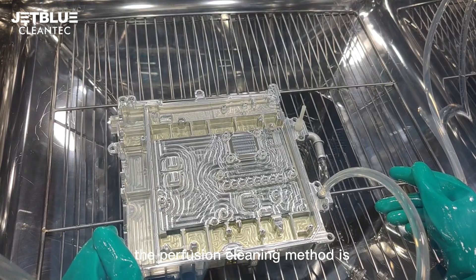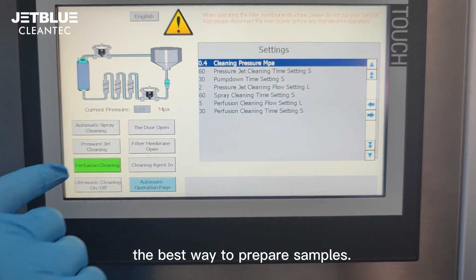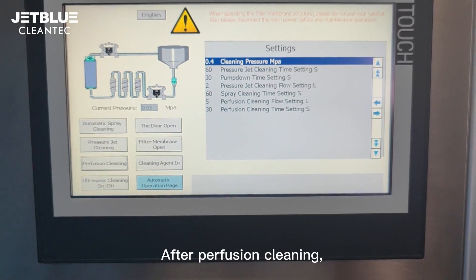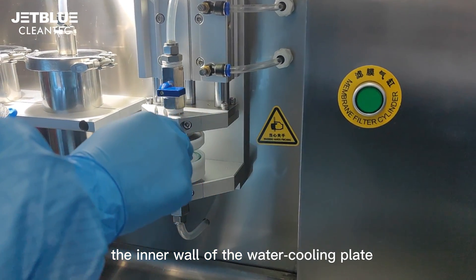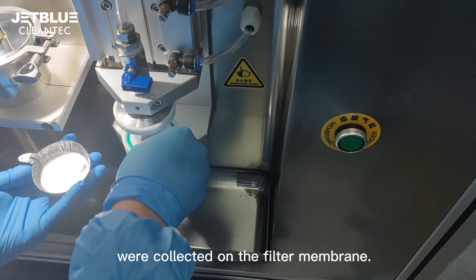The perfusion cleaning method is the best way to prepare samples. After perfusion cleaning, the tiny particles remaining on the inner wall of the water cooling plate are collected on the filter membrane.